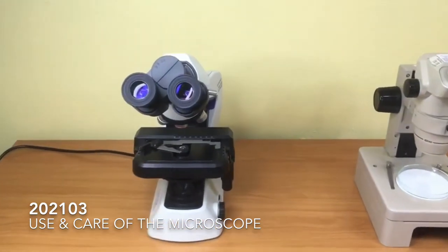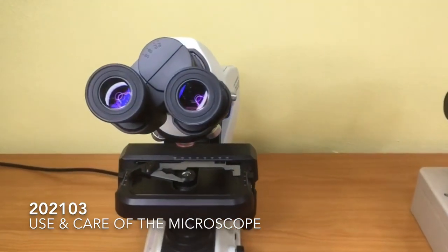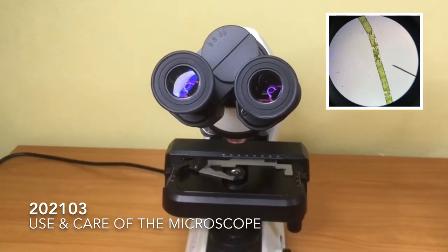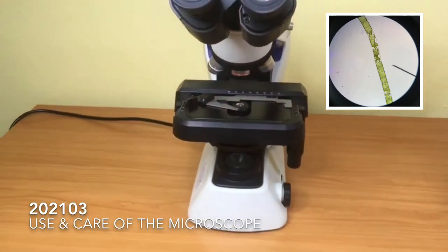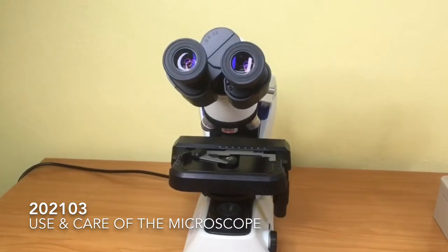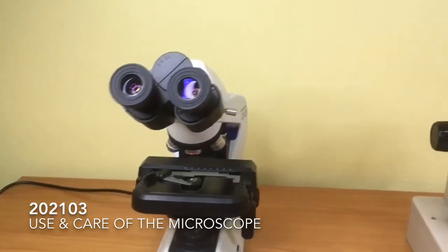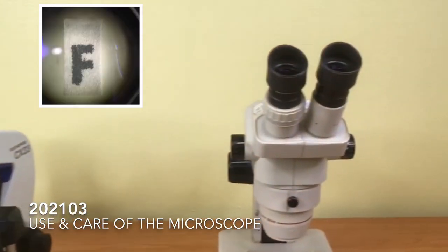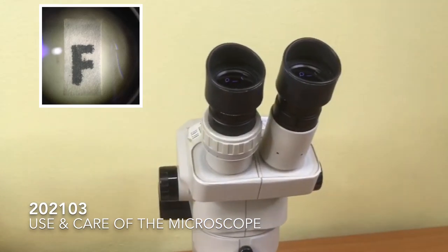Microscopes are one of the most important instruments used in almost all branches of biological sciences. We use microscopes to study objects that are too small to be seen with the naked eye.